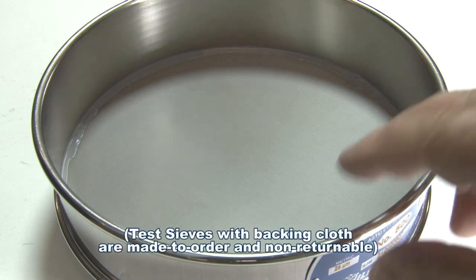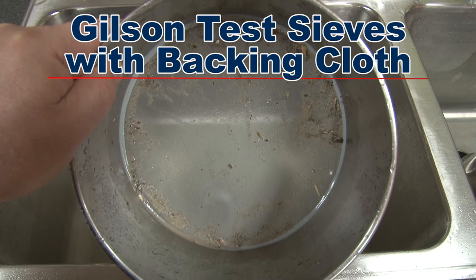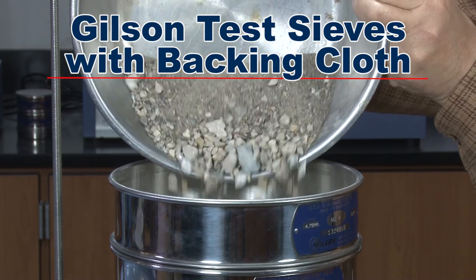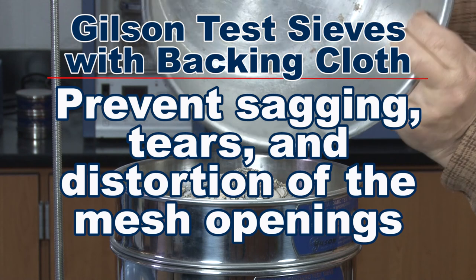Test sieves with delicate, fine mesh will have a longer, accurate service life when fitted with backing cloth under the sieve cloth. Backing cloth reinforces the fine mesh to prevent sagging, tears, and distortion of the mesh openings.